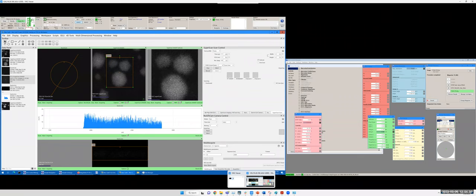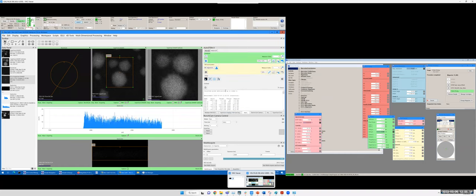It's 40 seconds. So during this time, I can quickly go through some of the panels. This is multi-shift EELS acquire. So this is similar, but this is mainly used for acquiring peaks, including zero loss. It can automatically apply cross correlation and align zero loss peak position for you. Spectrum imaging, this is doing mapping, actually. I can show a mapping to you later. Auto tuning, this is aberration tuning. Dectris camera control for changing parameters of the Dectris camera.